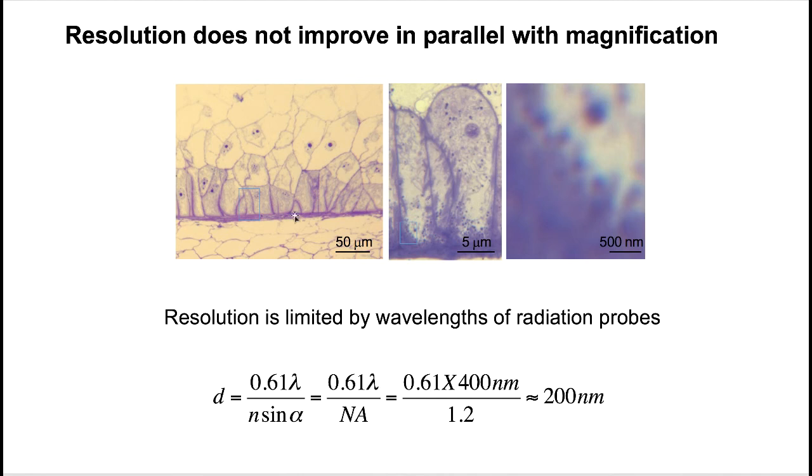This is so you can see the corresponding area from this cell and the other cells. Here the cell wall looks like a line, but in the magnified view it seems that the cell wall actually has some ingrowth that grows into the cytoplasm. There are a lot of round spots in the cytosol, and this is the nucleus of the cell. So you can get more information by magnifying this micrograph from low magnification to higher magnification.